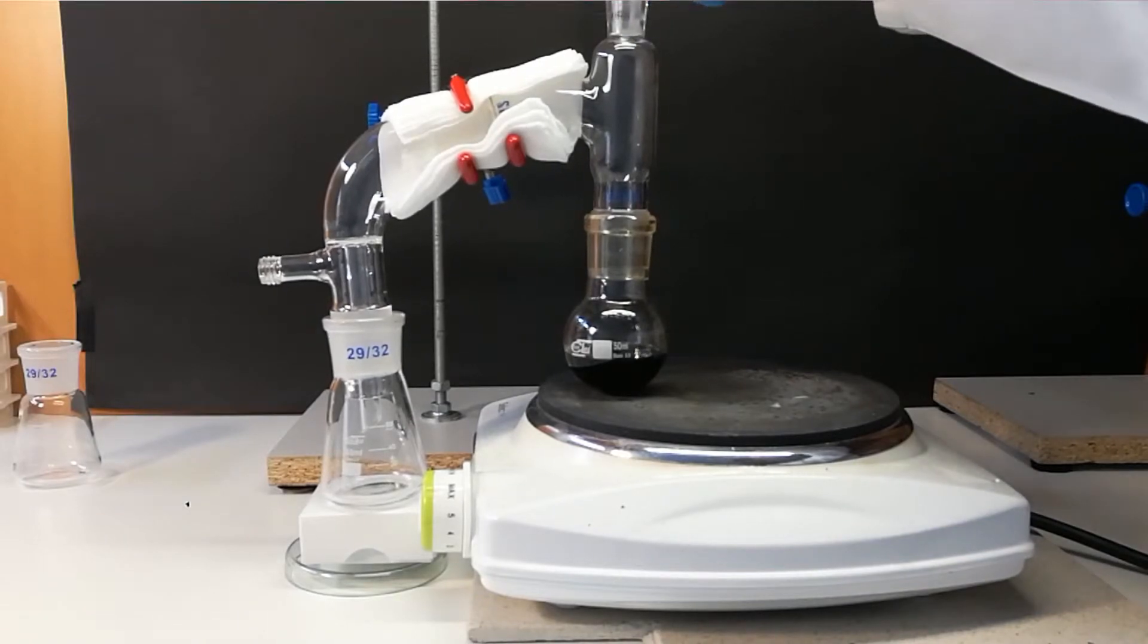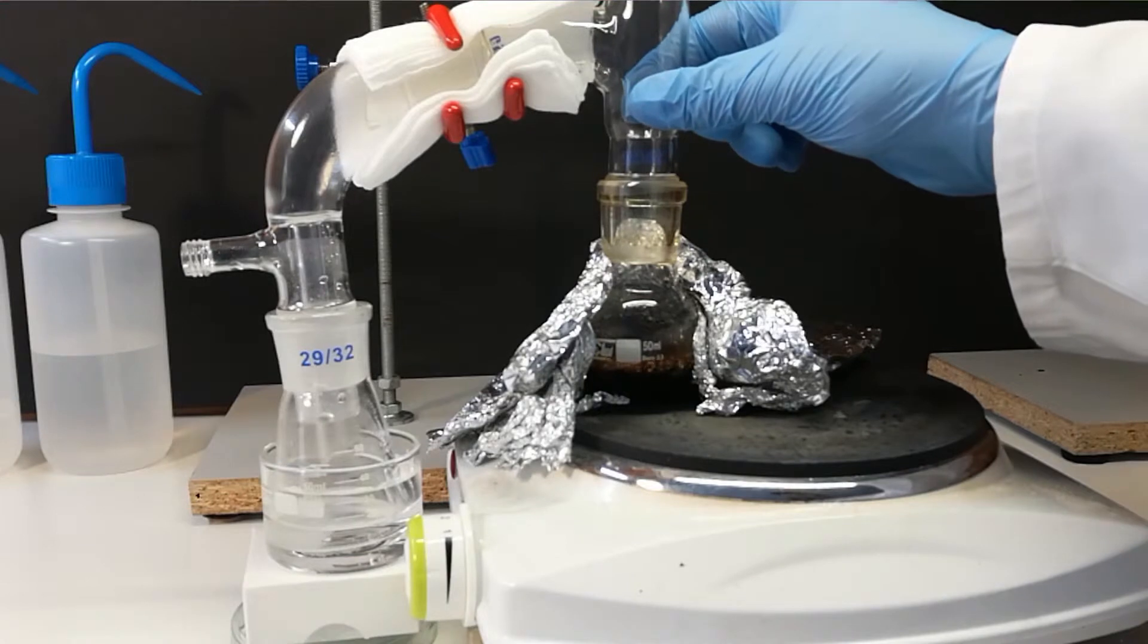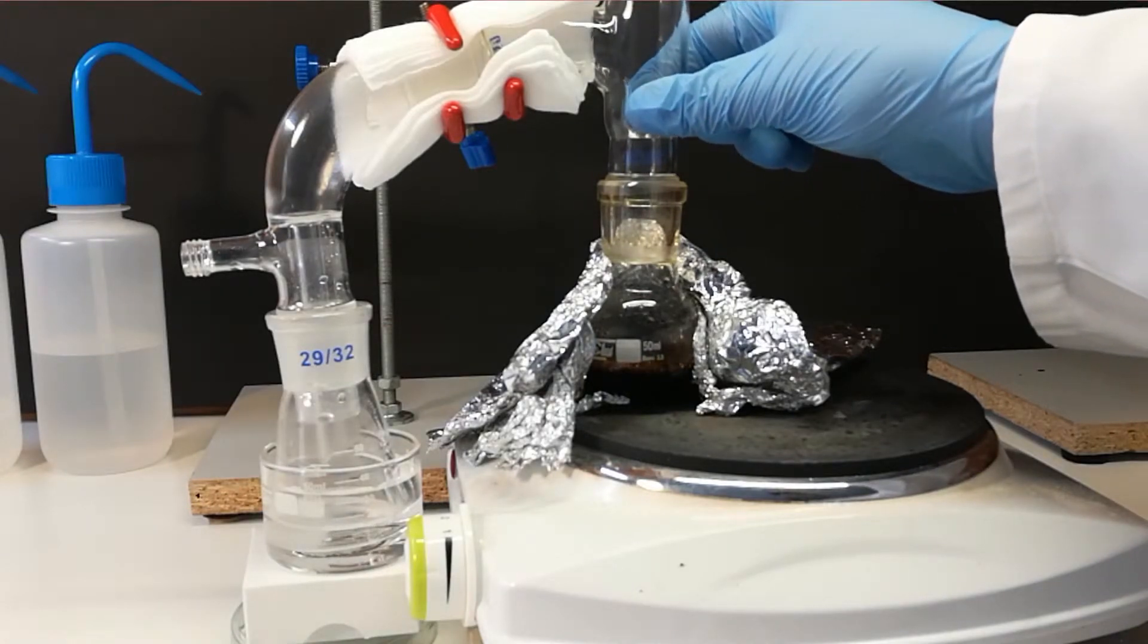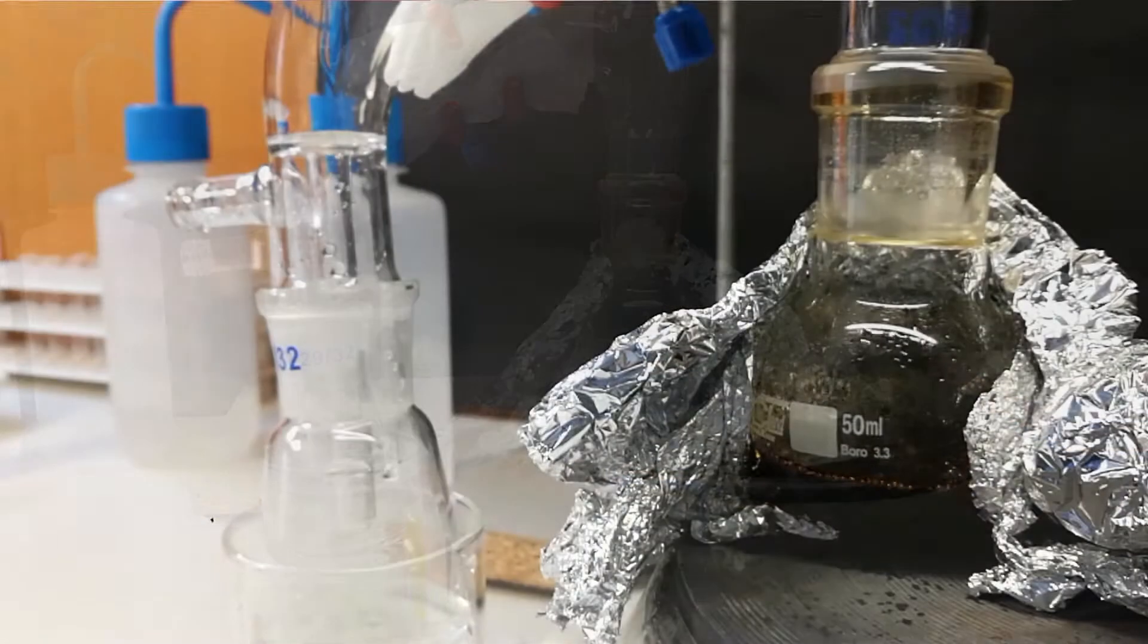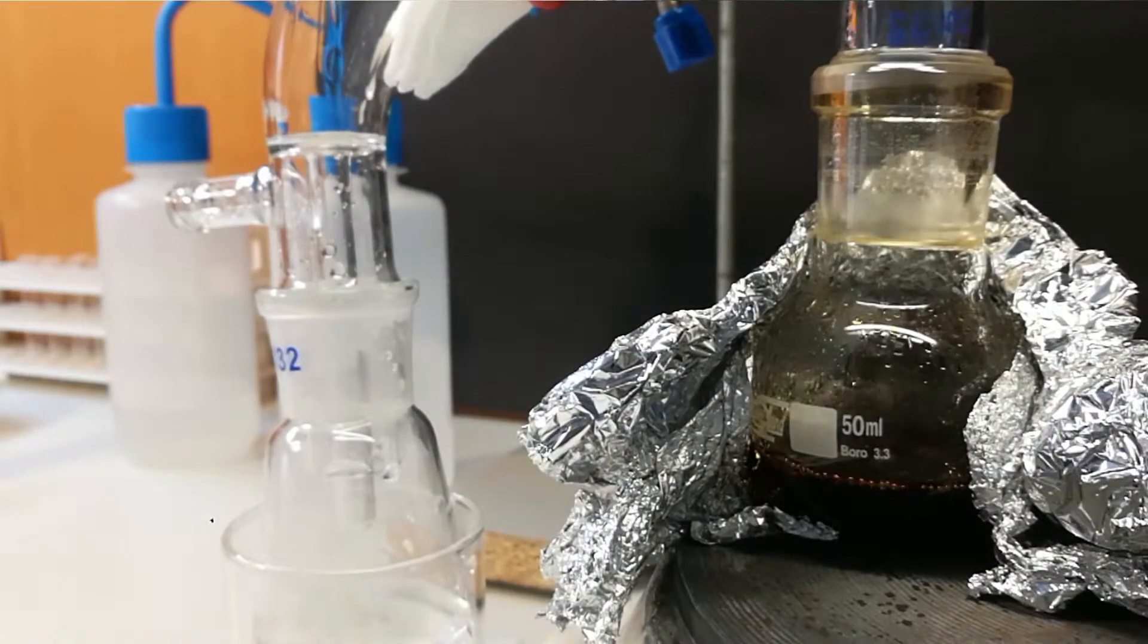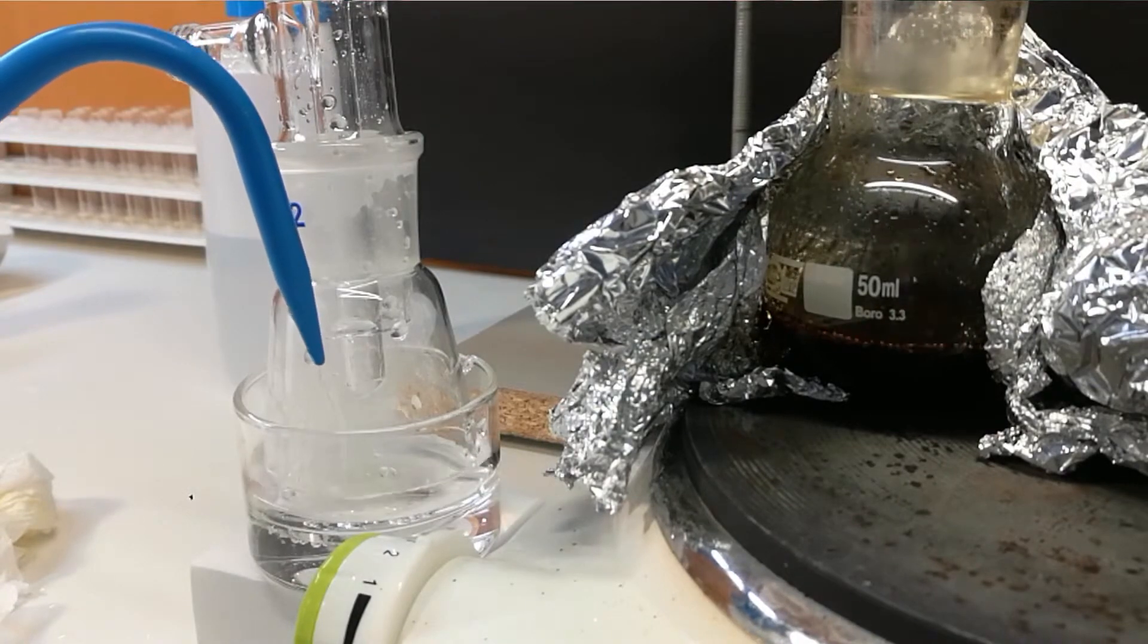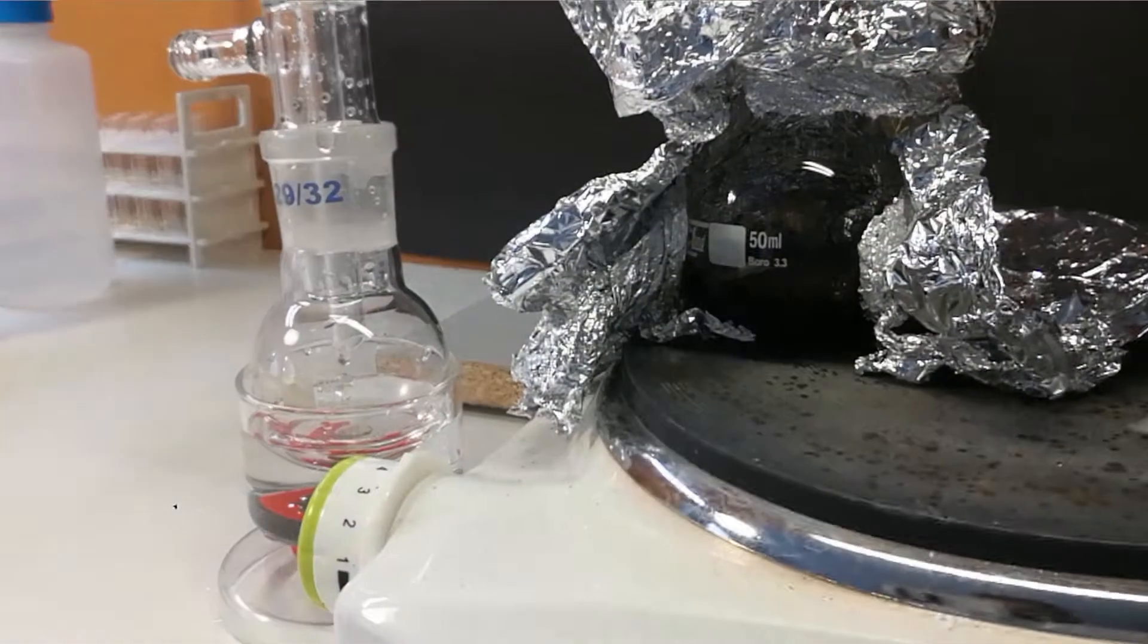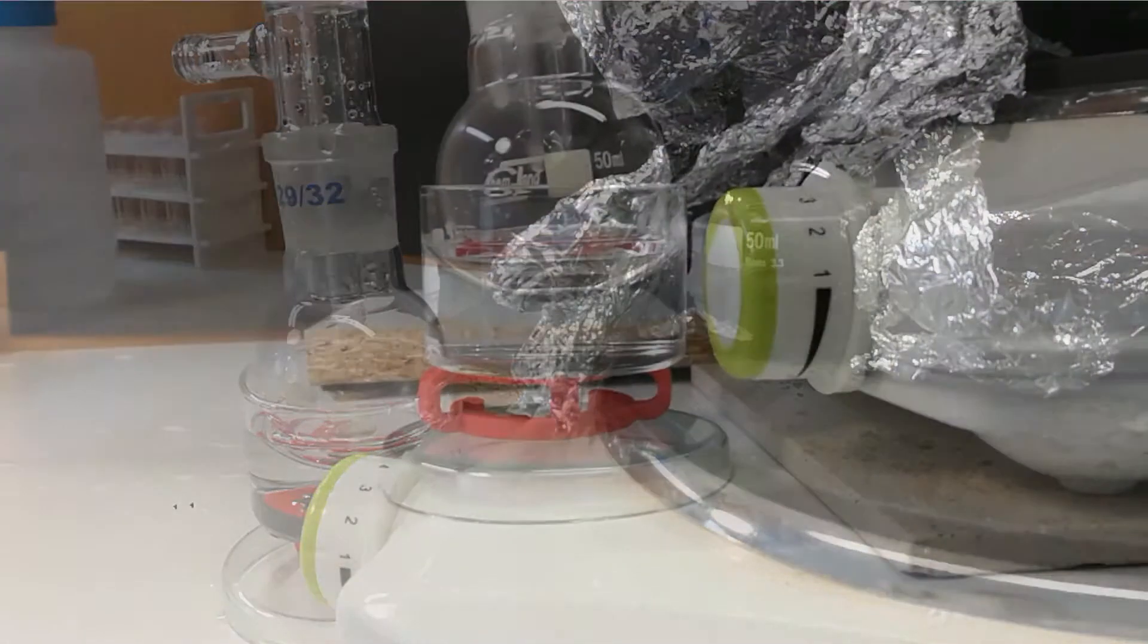Firstly, low boiling fractions are coming, like unreacted chloroform or ethanol and then water. Later at about 200 degrees our product distills over.